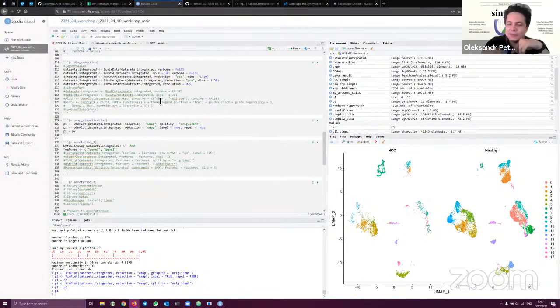Yeah, and while we are doing so I think we have 2 minutes for that. There's a question: Does it also plot t-SNE? So t-SNE, like small t and big S and E, is another approach for dimensionality reduction. However, today UMAP is the most widely used for such kind of data sets. Unfortunately, I'm not that smart in regard to the dimensionality reductions.